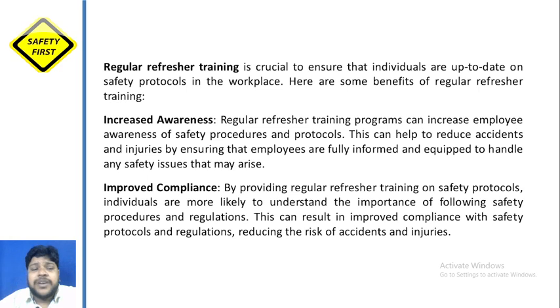Another thing is that if you visit some laboratory, you will find people who know things very well because they have been working there for a long time. In addition to training, there should be some refresher training. In this slide, I am talking about why regular refresher training is important for those working in a laboratory setup. Regular refresher training is crucial to ensure individuals are up to date on safety protocols in the workplace.